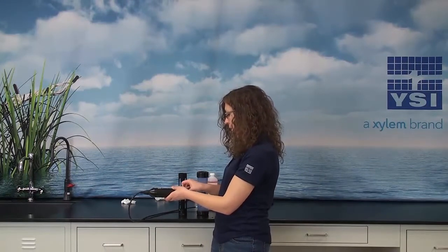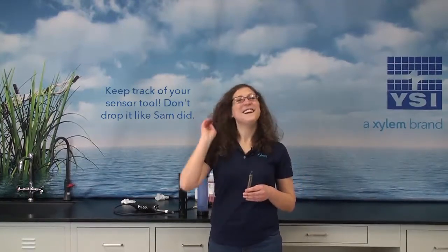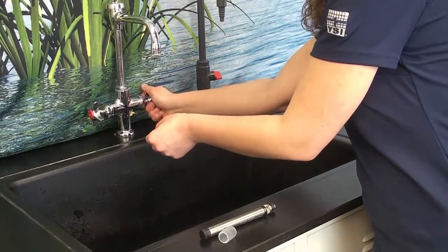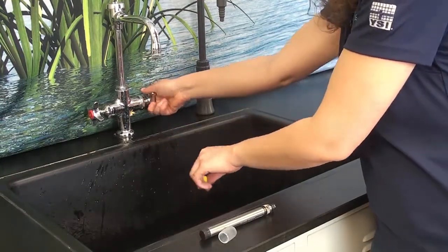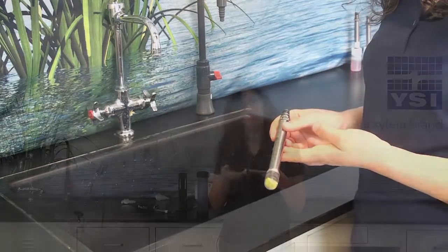Next is optical DO. This can also remain on the cable, but I'm going to remove it. The sensing cap needs to remain hydrated during storage. You can do that by submerging the end of the probe in DI water, or by keeping the cap that was shipped with the probe and placing a wet sponge in the bottom of it and keeping the probe stored that way. You can also put one of these caps on the probe while it's still installed on the cable. Don't forget the red cap to protect the connector.